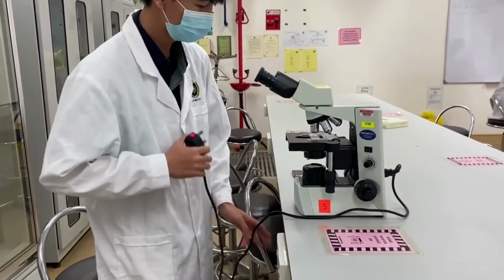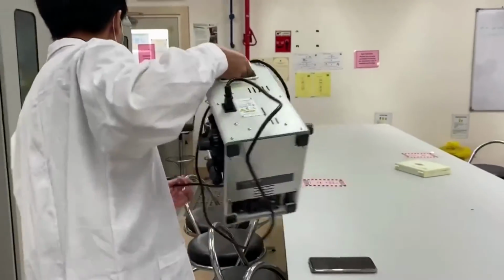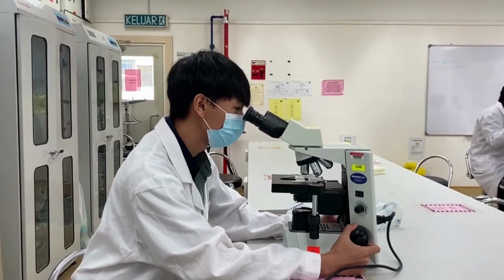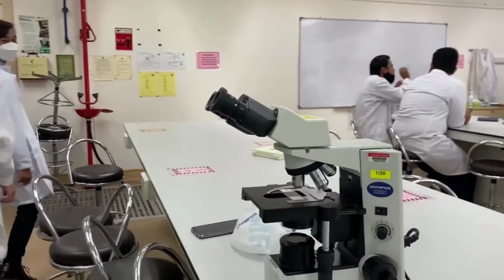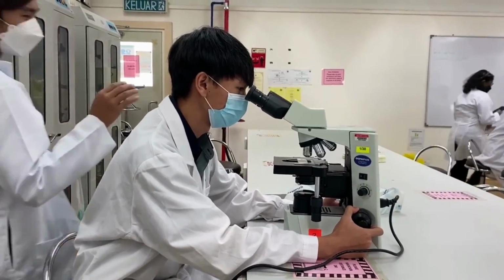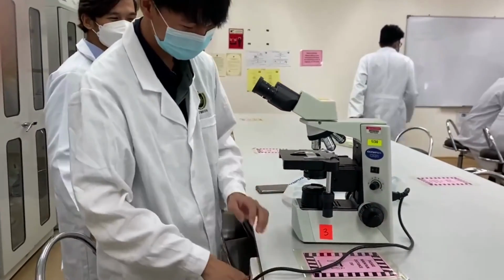I will continue on with the don'ts when handling a microscope. Never hold the microscope with one hand. Always hold it with both of your hands. Next is never leave the microscope unattended. Always cover it up when you are going elsewhere or when the microscope is not in use.